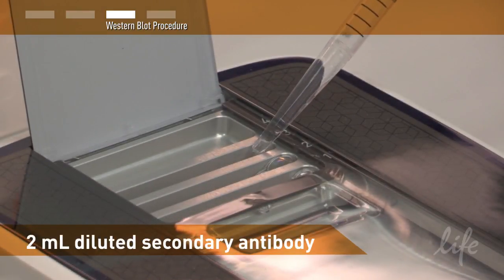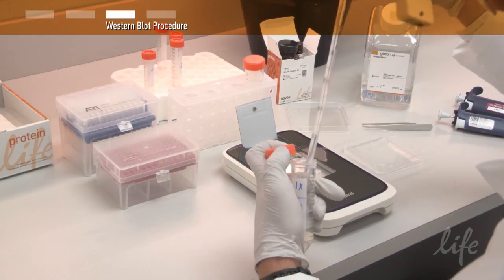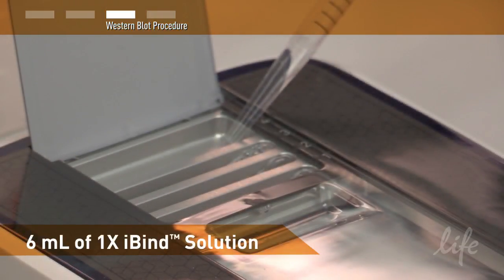Next load 2 milliliters of the diluted secondary antibody into well 3. And finally load 6 milliliters of the 1X iBind solution into well 4.